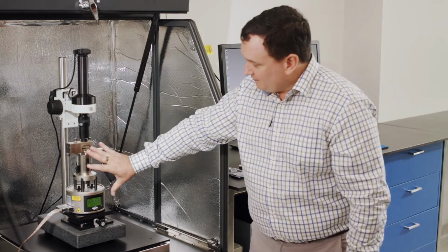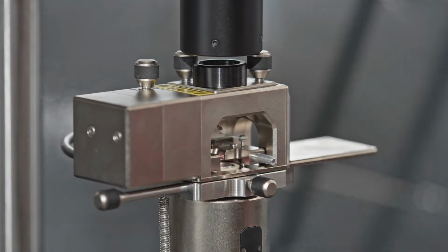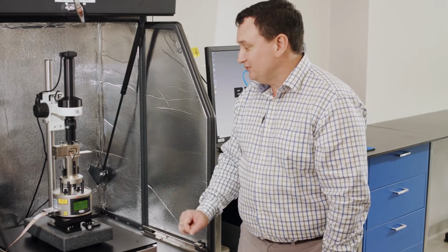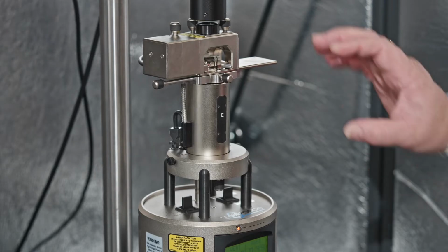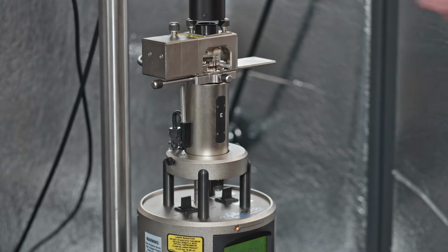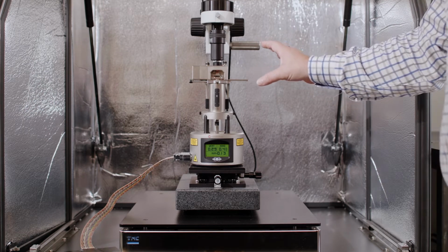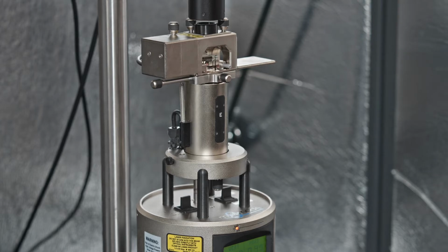And this part of the instrument here that we can see, this is the atomic force microscope. So we have a base, a precision scanner, which can move at angstrom levels and even sub-angstrom levels, so smaller than nanometers, really down into the atomic scale. And we have a laser deflection system, which again we will talk about in a little while, a probe holder, and finally our sample. So what we're going to do now is we're going to break this instrument down into its components, and we'll talk about each of them individually.